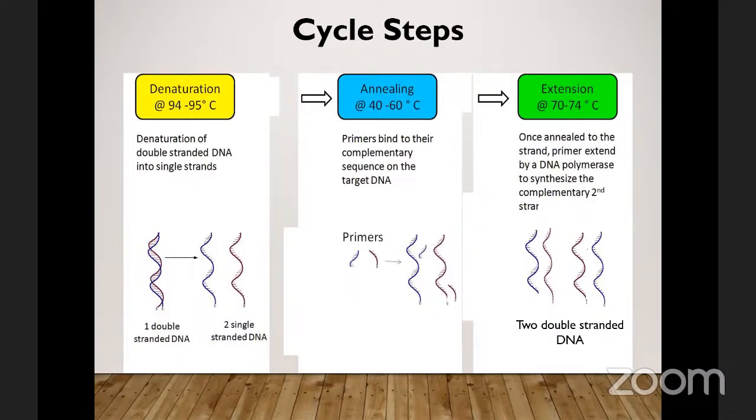Remember what we said about primers, that they are very specific. They are designed for specific targets. And if the target is not in the sample that you have extracted, let's say you have extracted a sample and you actually did DNA extraction, human DNA is in that sample. It will be abundant because it is a human sample, and you are looking to maybe isolate the herpes simplex virus.